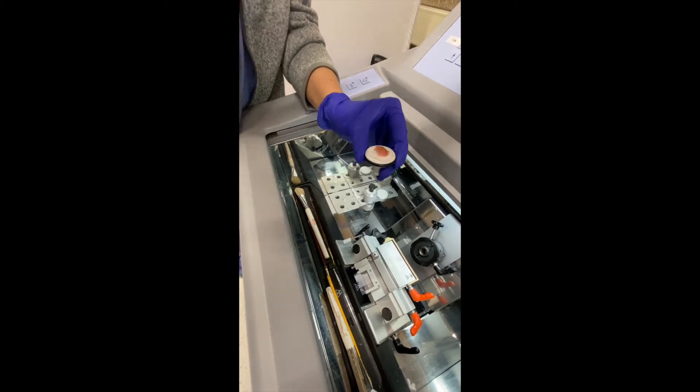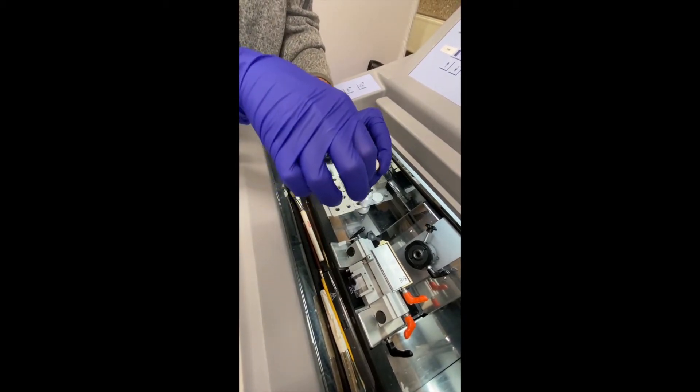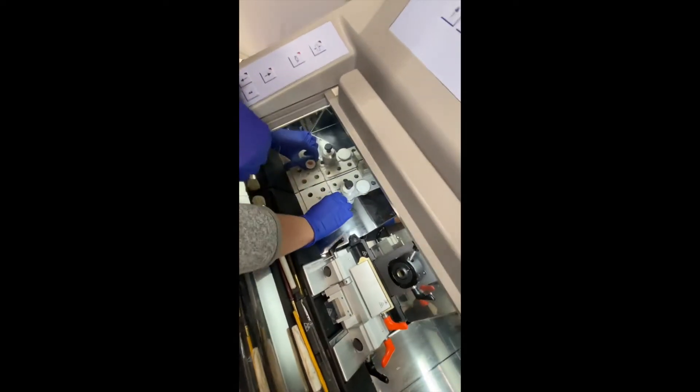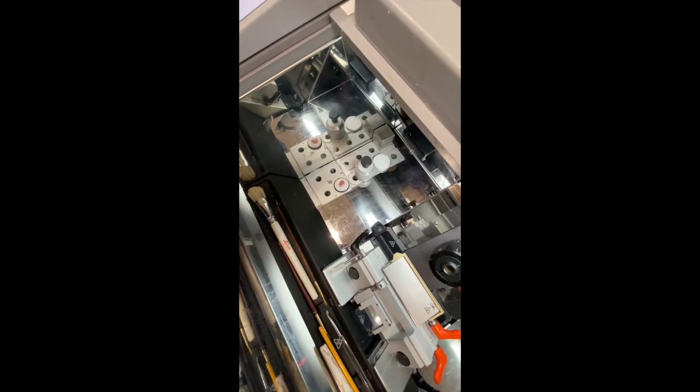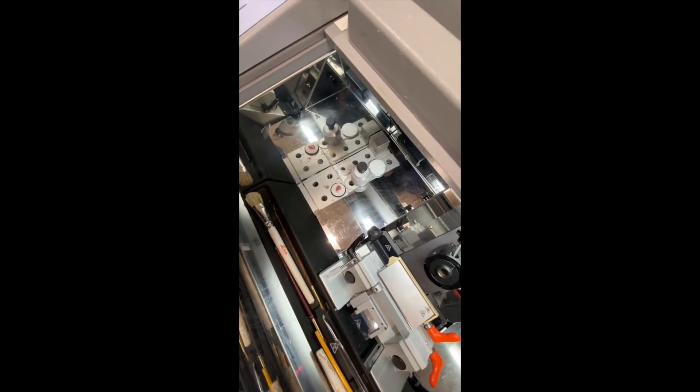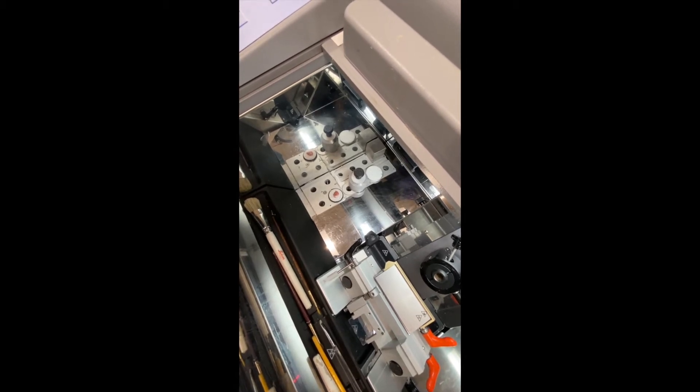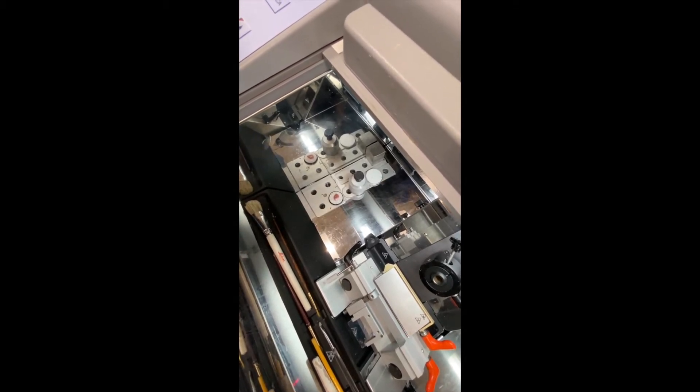Once you place the OCT media over the top of your specimen, you're going to put the specimen back into the cryostat and allow it to freeze. In order for the specimen to freeze quicker than just letting it sit alone, you may use something called a peltier element or a heat sink, which is what we're going to use in this circumstance.